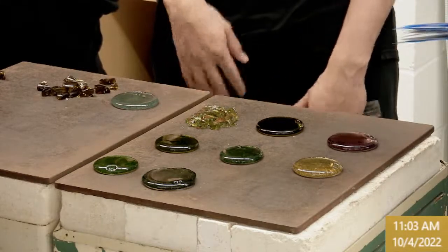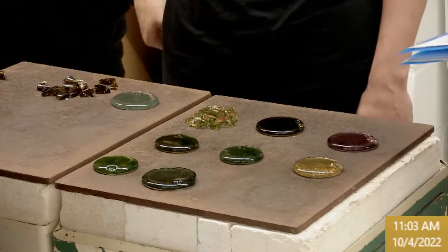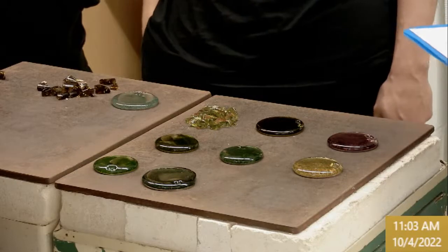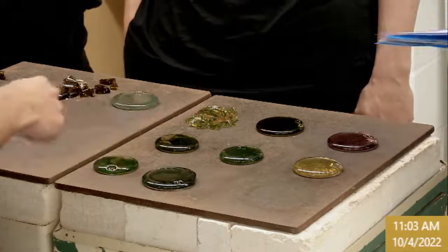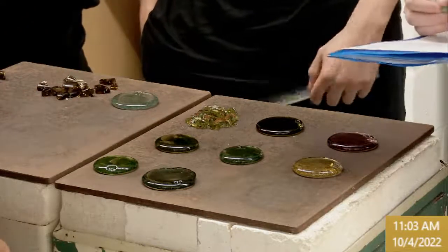Yeah, so watch, as the stamp moves in, you're going to see it, and it came off of this edge. That edge, what's called spalling, is going to create this, and there were some tiny little particles, and I think you might still have a little one, so be careful with that.